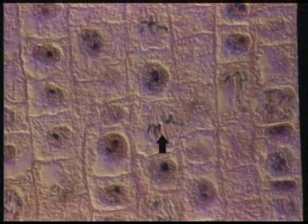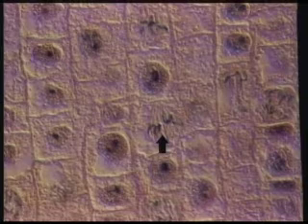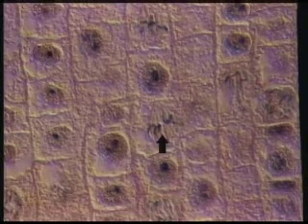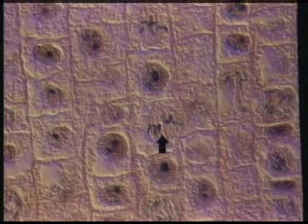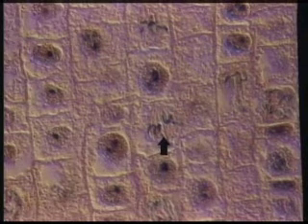Microtubules only measure about 250 angstrom units in diameter, so they're visible with the electron microscope. Individual ones are not visible with a conventional light microscope, but you can see groups of them clumped together to form these so-called spindle fibers in this preparation right here.